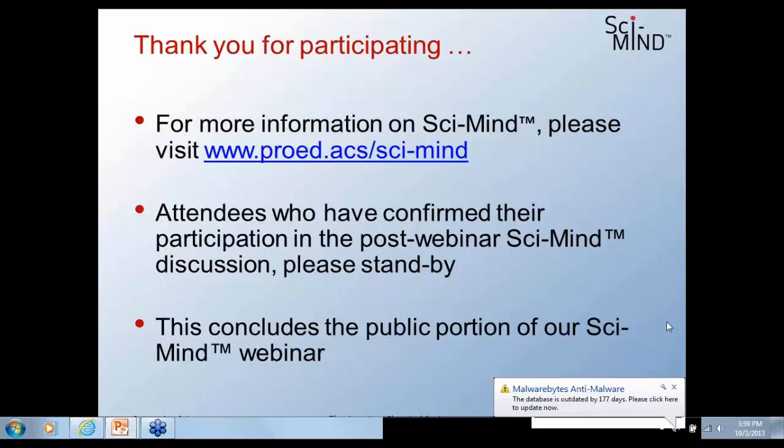Of course, an octanol-water partition coefficient, which I'll use as one example, is a pretty nice measure of polarity. So a very high octanol-water partition coefficient is going to tell me that this thing really does like our more fatty matrix of something like a nonpolar column. Actually, that tells me that it's probably going to be retained fairly strongly on a nonpolar column. So what I might think about looking at, though, is if I have my analyte, which has one partition coefficient, and then other impurities or other compounds in the matrix that I want to separate it from that have another partition coefficient, think about how different those are from each other. And if they're very different from each other, that tells me I'm probably going to have a relatively simple time separating them. If they're very similar to each other, then I've probably got a tougher separation problem.